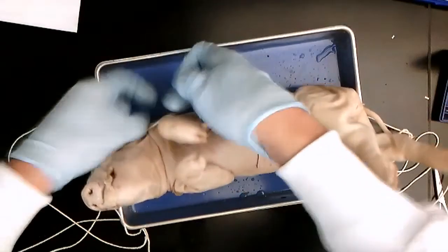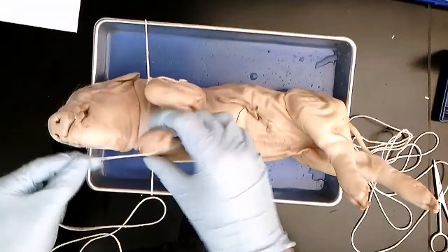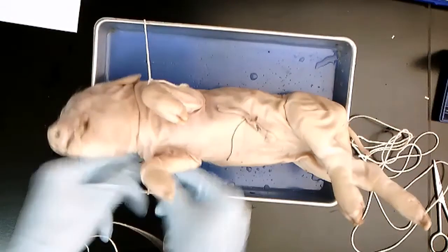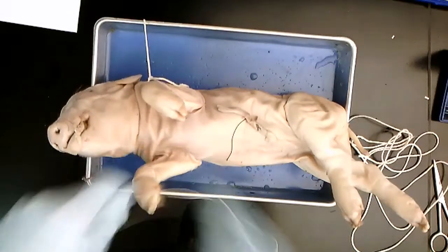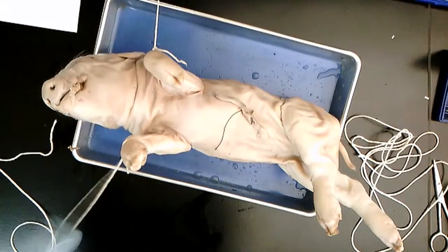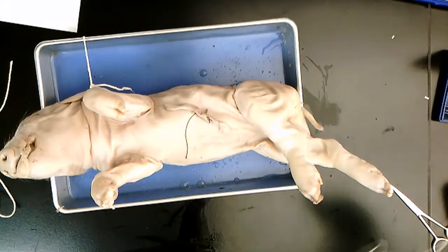And to me, this is one of the most challenging aspects of it all, because with the pig this size, the string isn't as necessary as it is, in my opinion, with a smaller fetal pig, but it could make it a little safer for your students. We have one end tied up and do the same with the other set of legs.